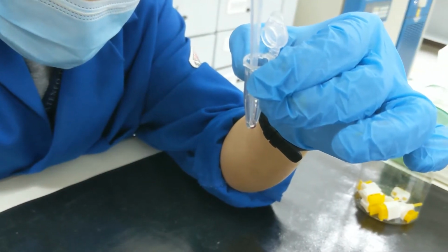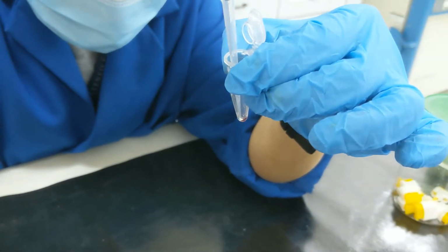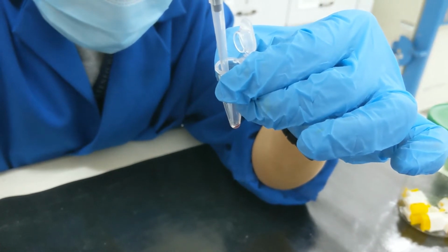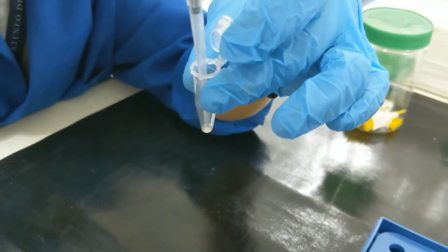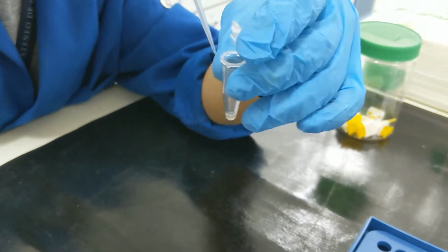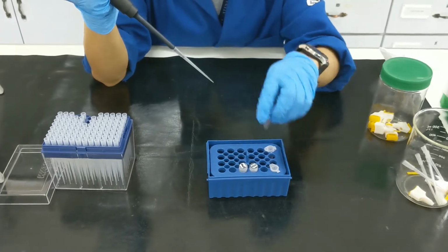And then we're gonna continue aspirating the serum until we have aspirated all of the serum and only the pellet is left in our original tube. And then we'll dispense more of the serum into the separate tube.